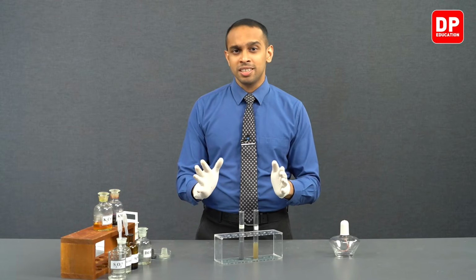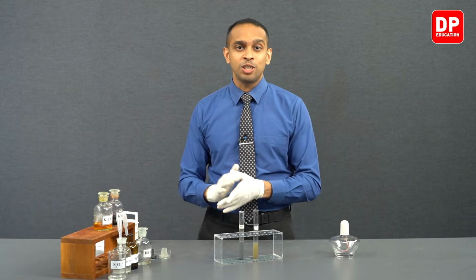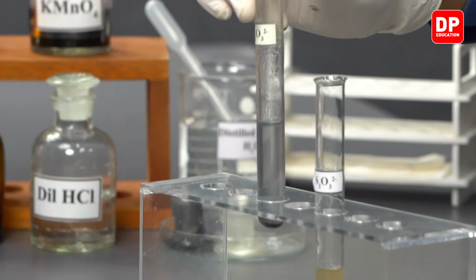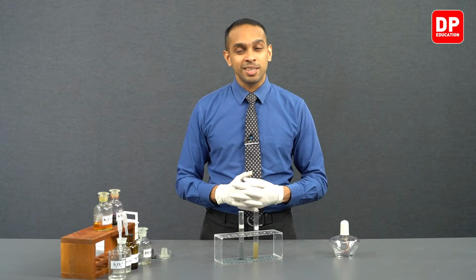However, if you heat the precipitate that is formed, you see that lead thiosulfate gets converted into lead sulfide, which is a black color precipitate. So the white color lead thiosulfate precipitate gets converted into a black color lead sulfide precipitate when you heat it. So that was our final observation, forming the black color lead sulfide precipitate. So after that observation, we actually conclude all of the tests that we can do to identify the presence of thiosulfate ions in aqueous medium.